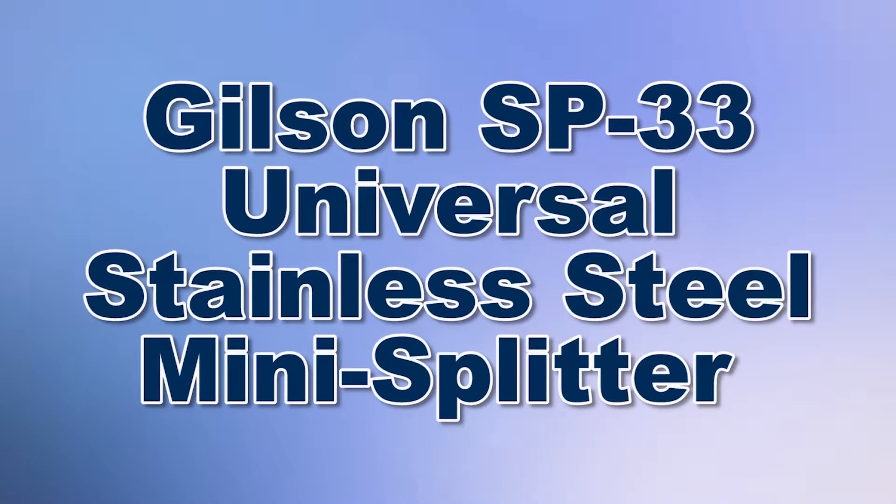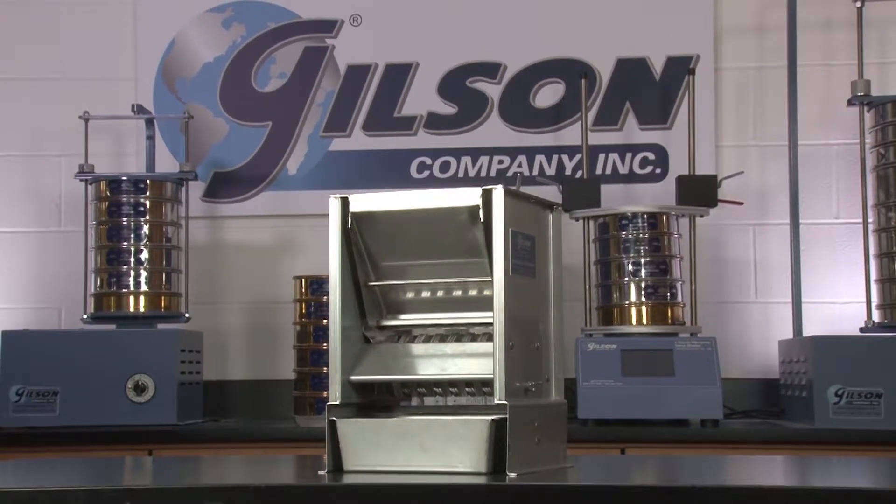When you need reliable representative samples for accurate testing results, Gilson is your best choice.